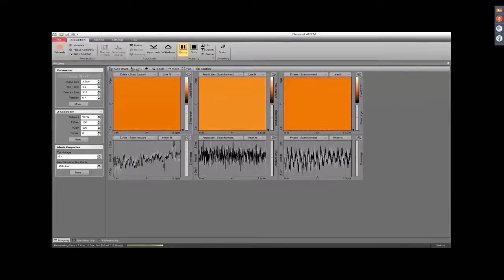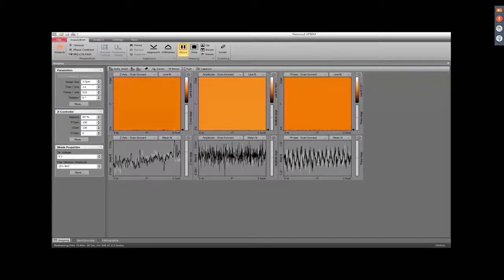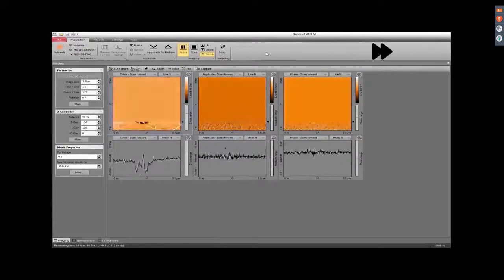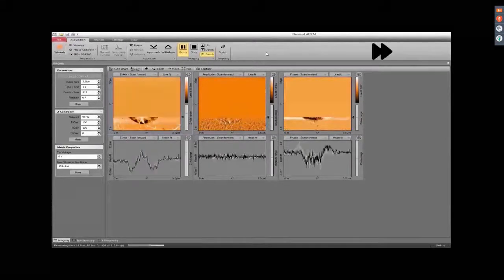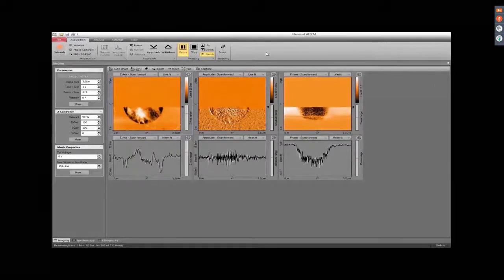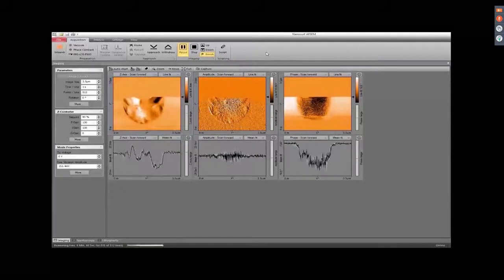Now you can see nice features appear, for example, some graphene wrinkles in the topography image, and a very interesting feature which can be soon seen in the AFM error image is the drum effect, which is revealed by amplitude instabilities in the center of the membrane.